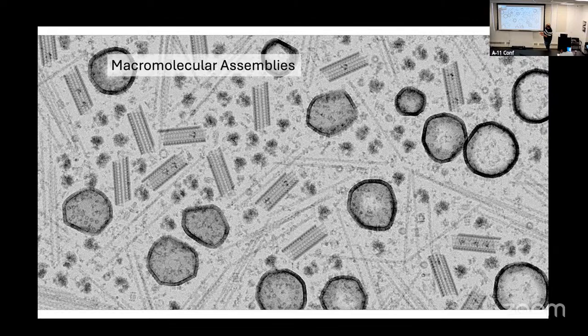We tagged it as an assembly for the software, and when it places each of these, it randomly places MIPs inside of it. So you can build whatever you want in, say, Chimera, and define different sub-models and send them in, and it will put in different instances. It'll put in the initial model, like whatever the first submodel is, in this case a microtubule, and the subsequent models will be randomly selected.